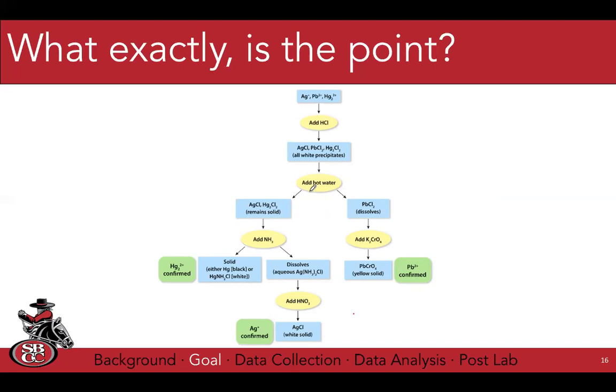So what I'm going to do now is walk you through those calibration steps, what you should expect to see, and show you how those calibration steps flow through this chart. And then what you'll need to do is take some unknown, create a protocol for you and your group, do a series of tests and properly identify what's there. So we'll keep this chart with us as we progress.